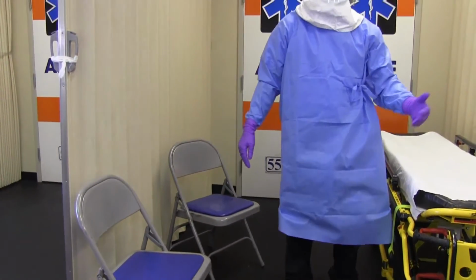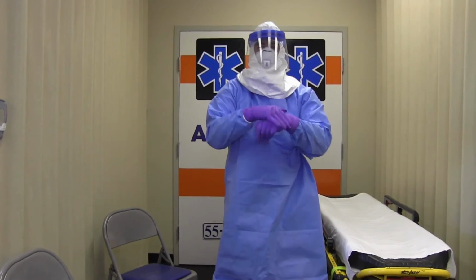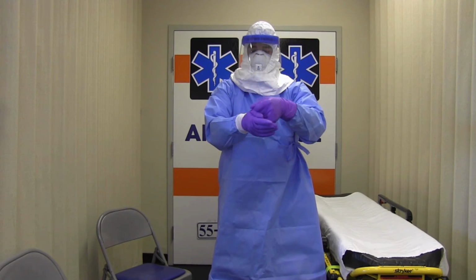Once your boot covers are removed, you will disinfect and remove your outer gloves. Again, you'll use an alcohol-based hand rub. Remove and discard your outer gloves, taking care not to contaminate the inner gloves during the removal process.